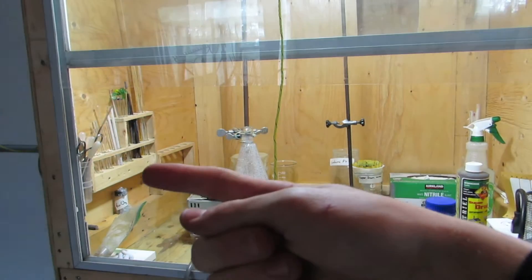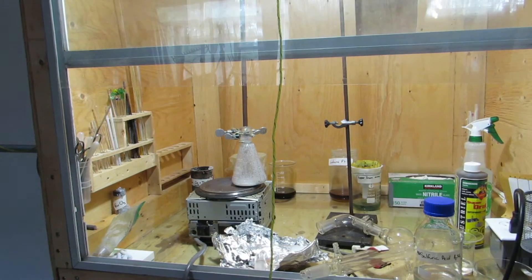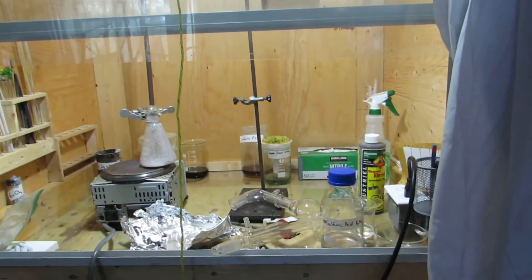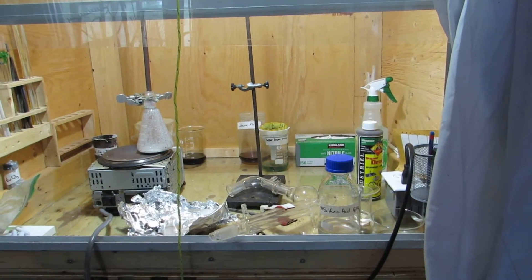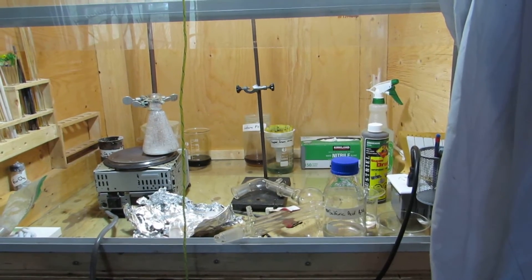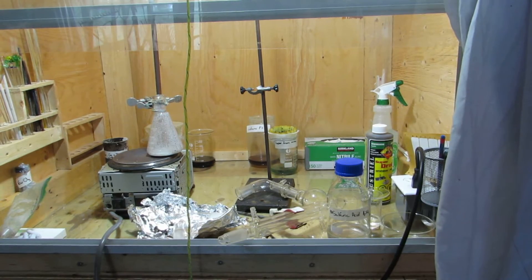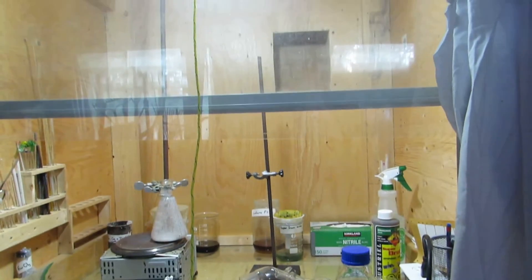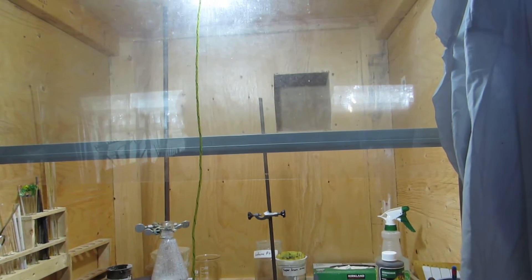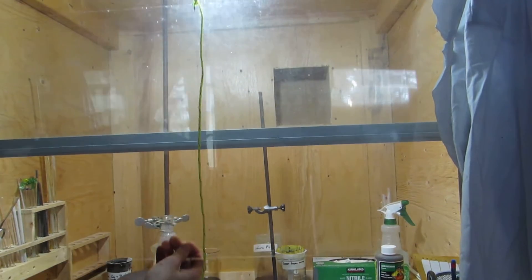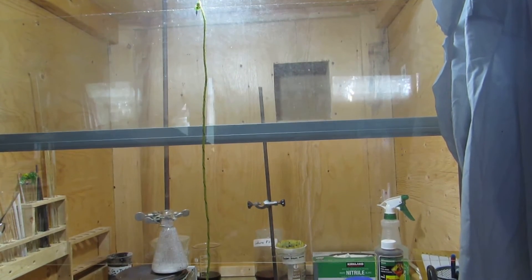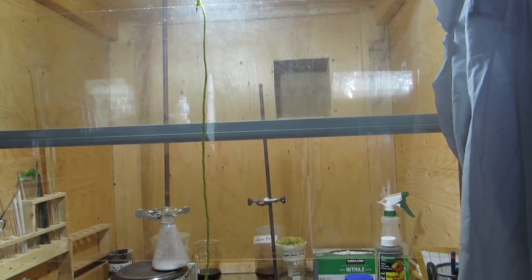So on the side I got a bunch of different rods for mixing stuff around. And I have a glass plate in the bottom, a couple other experiments around the back. I was just distilling some sulfuric acid so that's kind of what's in the middle of it right now. I do have a plate up here that you can fold down so that you can have varying degrees of airflow.